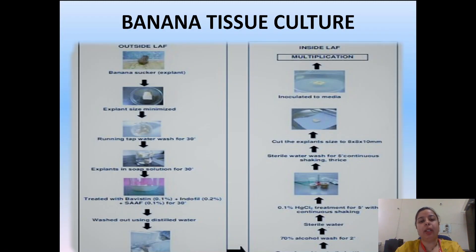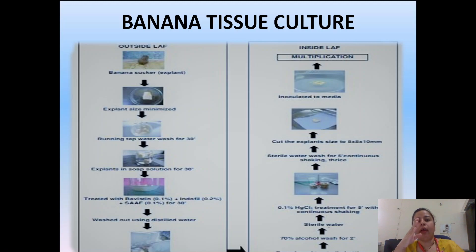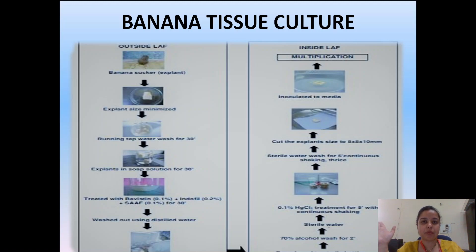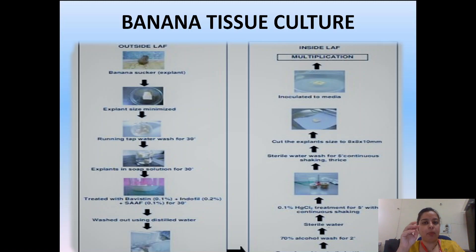Today's experiment is banana tissue culture. Part of the experiment is done outside the laminar air flow unit and planting the explant in tissue culture medium is done strictly in the laminar air flow cabinet in the HEPA filter chamber. Firstly, we are preparing the explant. There are two explants that can be taken in the case of banana: first is sucker, and second is the fruit.